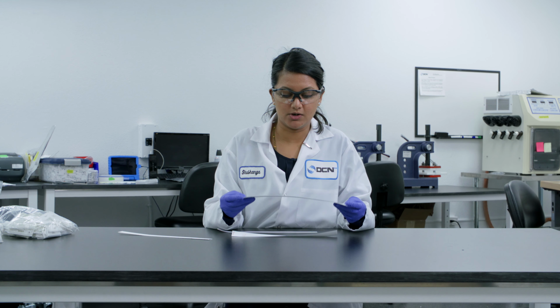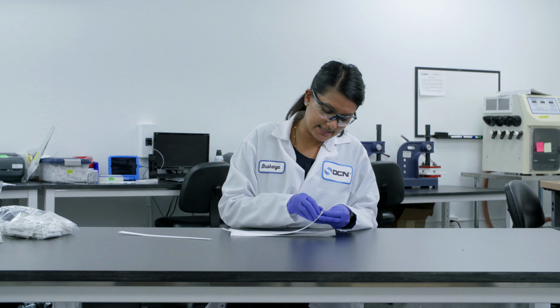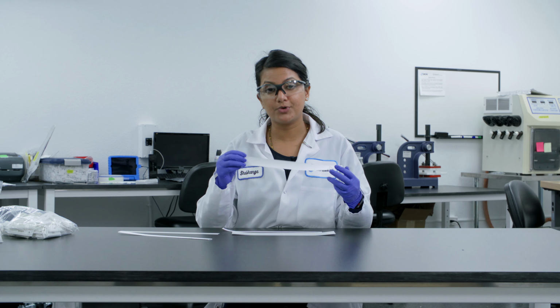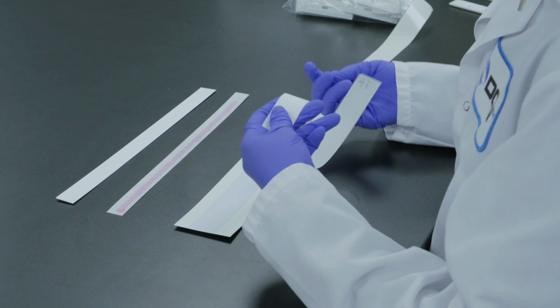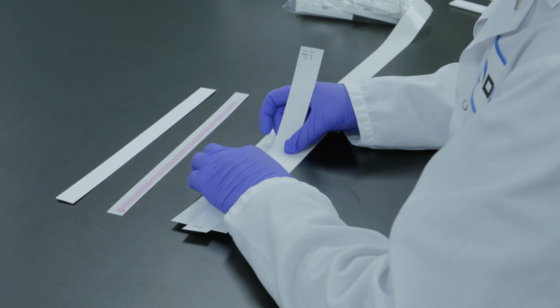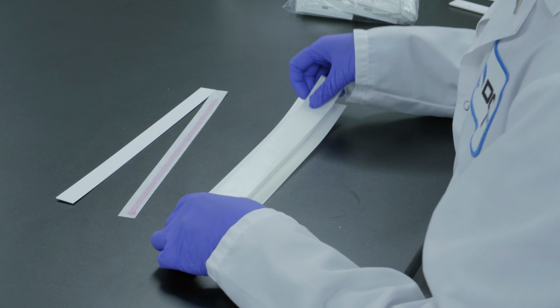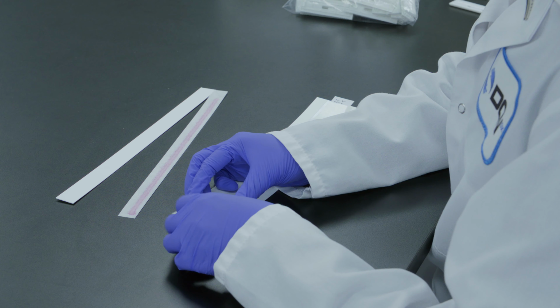So what I'll need is this backing card. This is what is going to hold all of the different components of my lateral flow strip together. So first I'll take out the adhesive liner, and I will take our membrane where we dispense the capture antibody and line it on the card. And then just to make sure it adheres, very gently press.